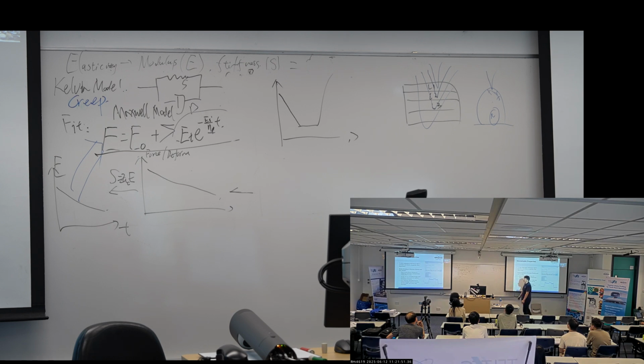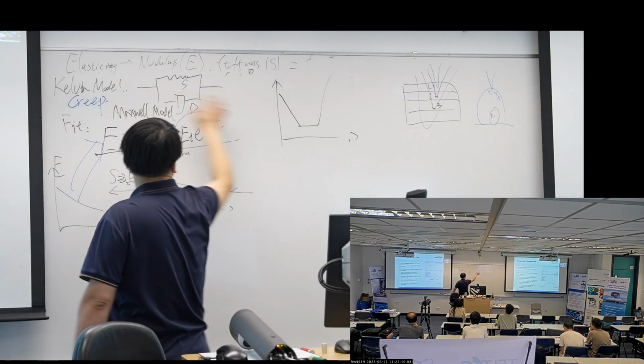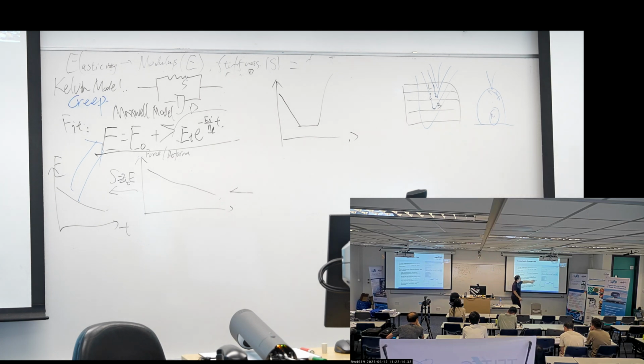For polymers, we may also need these different layer structures, so people invented such complex force curves to study the properties at each layer.